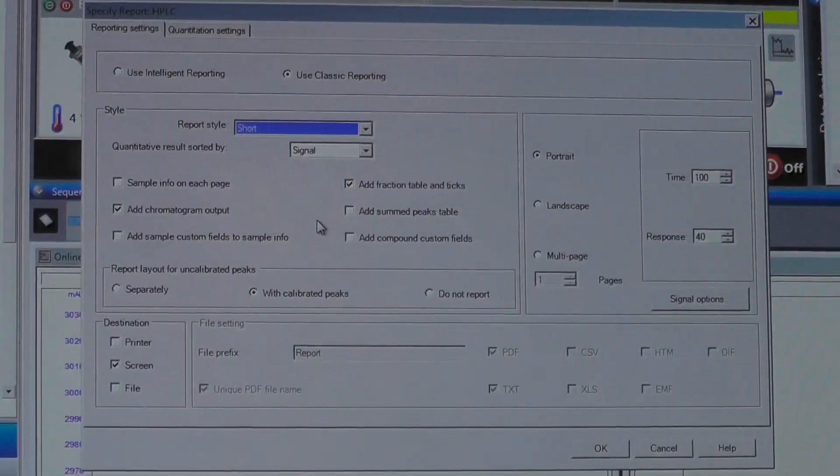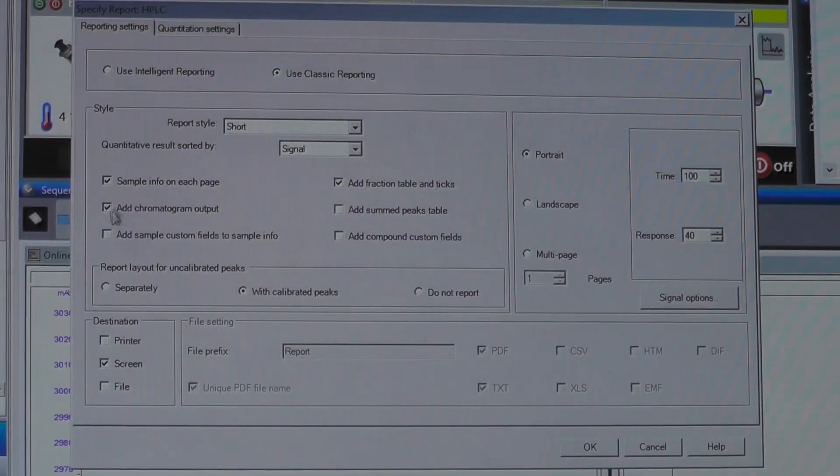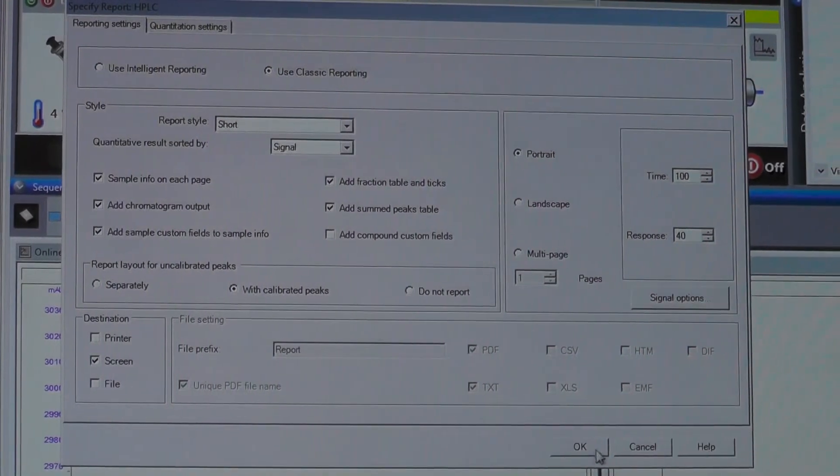Following the previous step, a Specify Report HPLC window will show up on the screen. Select the analysis that you want and click OK.